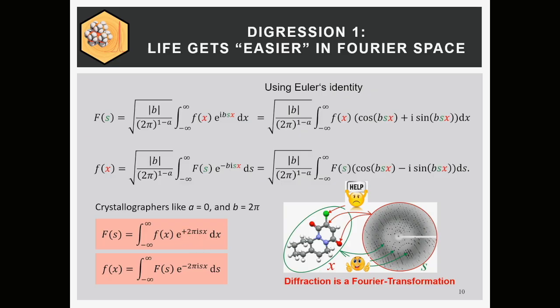So if we do powder diffraction, or if we do crystallography, we have to understand what Fourier transformation and back transformation does. Just to remind you, it's only a transformation, so you're not increasing the knowledge, you're not increasing the information content. It's just one space and the other space. Fourier space is our diffraction space, and the normal space is the space of our, if we have X-rays, of our electron density, okay?